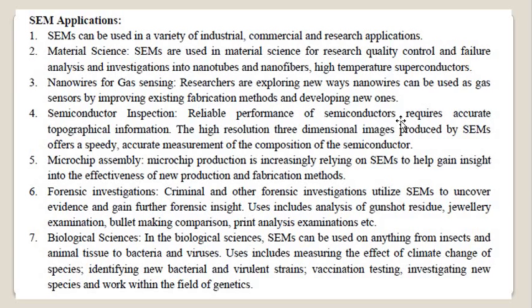Okay, so electron microscopes are very useful instruments and require huge money for purchasing, but they also have a huge number of applications in every field. We can use it, right? And for the biological sciences, for regular scientific study, as well as for research up to the genetic level, or morphological differentiation, even minor morphological differentiation can be studied with the help of the electron microscope.